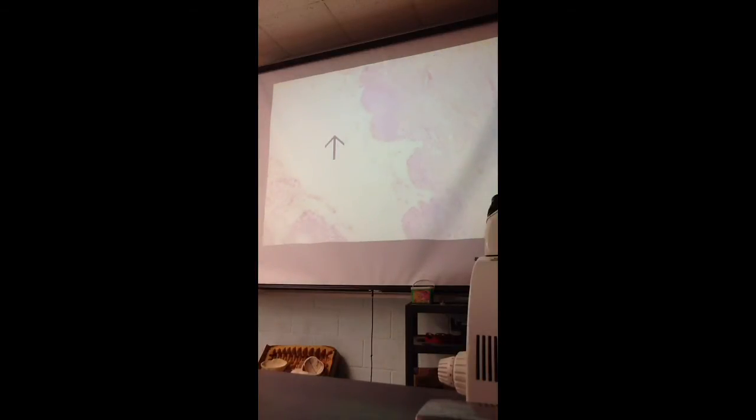So this is all the substance of the prostate around the prostatic urethra. We'll again look at the prostate. There are other slides to look at the prostate, better slides that show it.